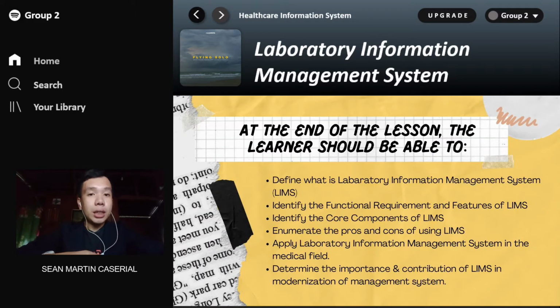We have the following objectives that we will achieve at the end of the lesson. The learner should be able to define what a laboratory information management system is, identify the functional requirements and features of LIMS, identify the core components of LIMS, enumerate the pros and cons of using LIMS, apply laboratory information management system in the medical field, and lastly, determine the importance and contribution of LIMS in the modernization of management systems.